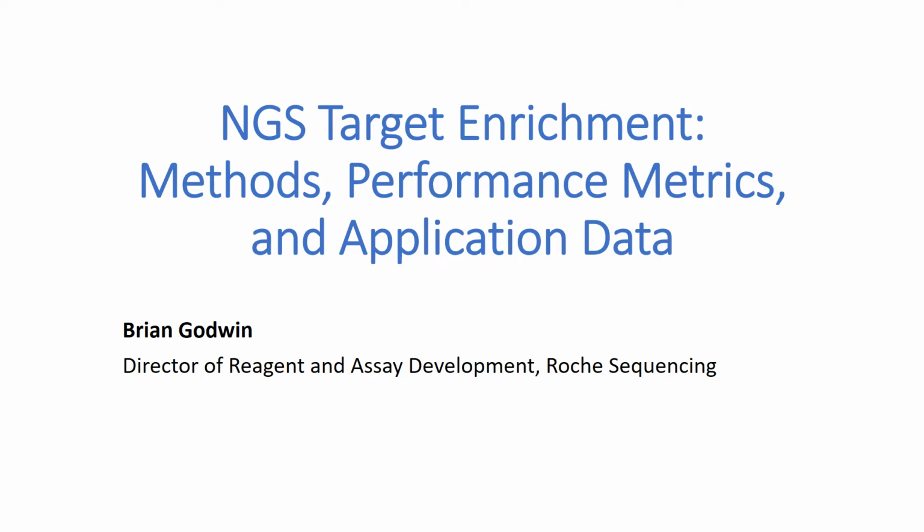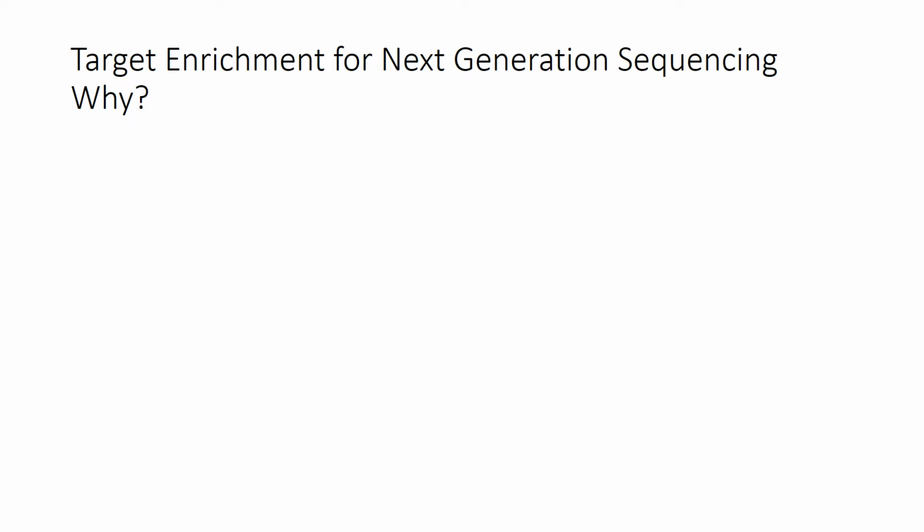All right, thank you for the introduction and for giving me the opportunity to talk about target enrichment for next generation sequencing. I'm going to be talking about some methods, performance metrics, and application data, but I'm going to start with why do target enrichment for next generation sequencing?